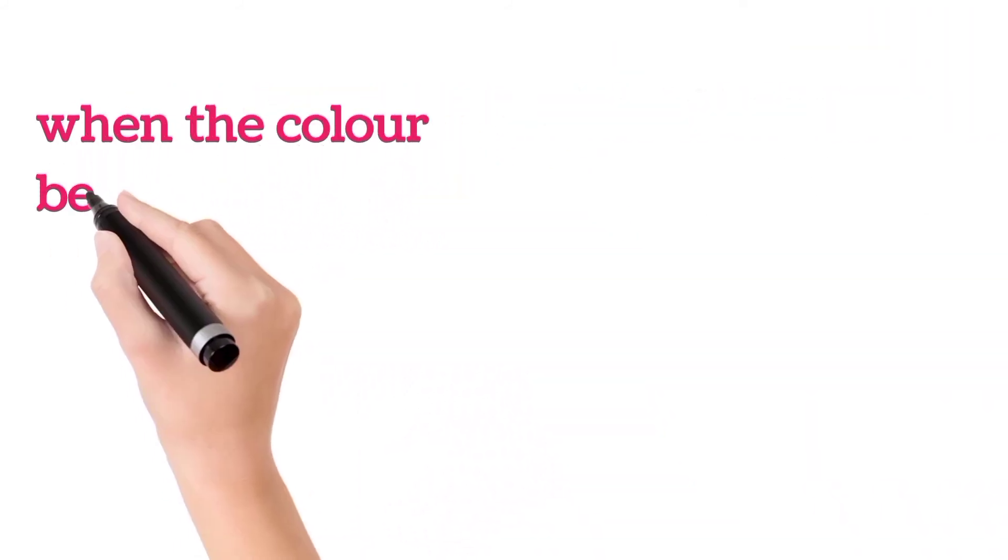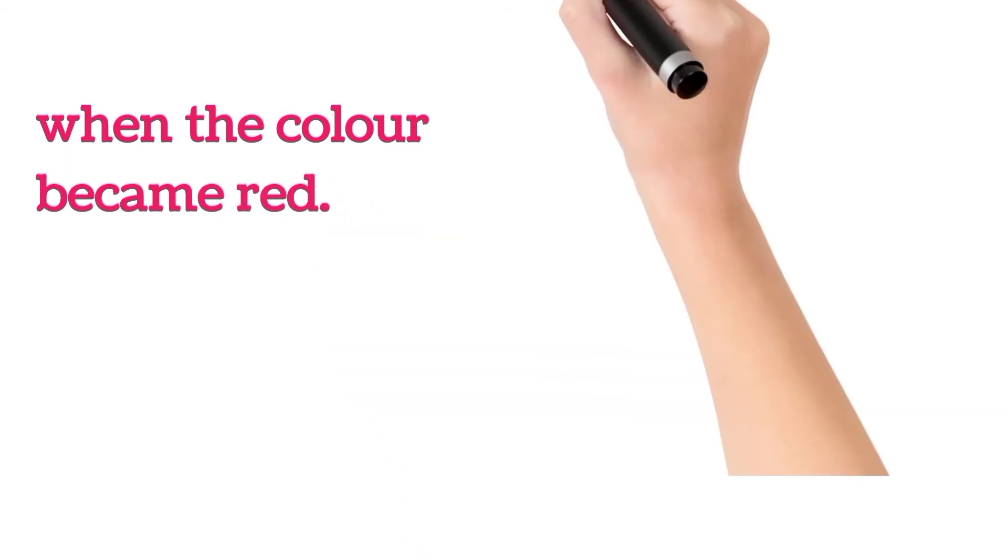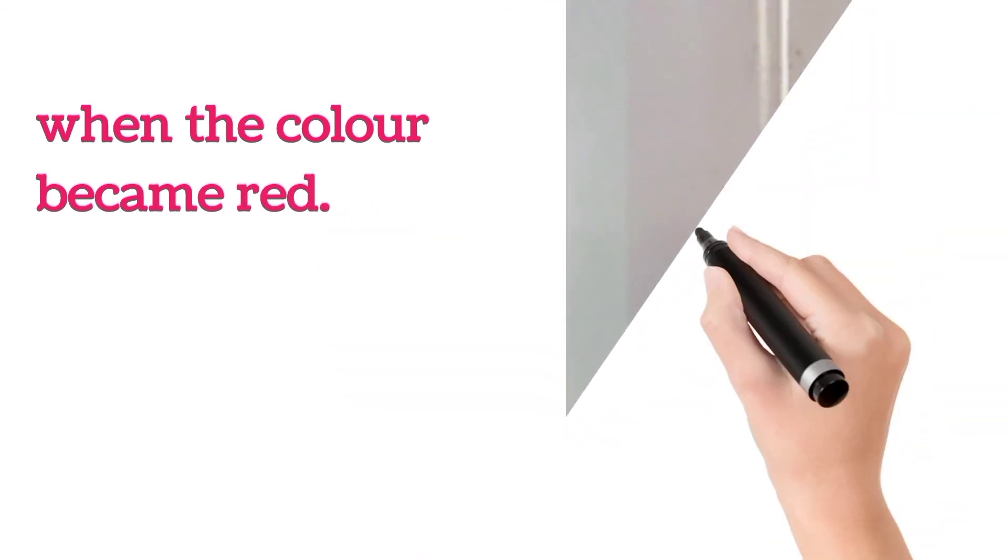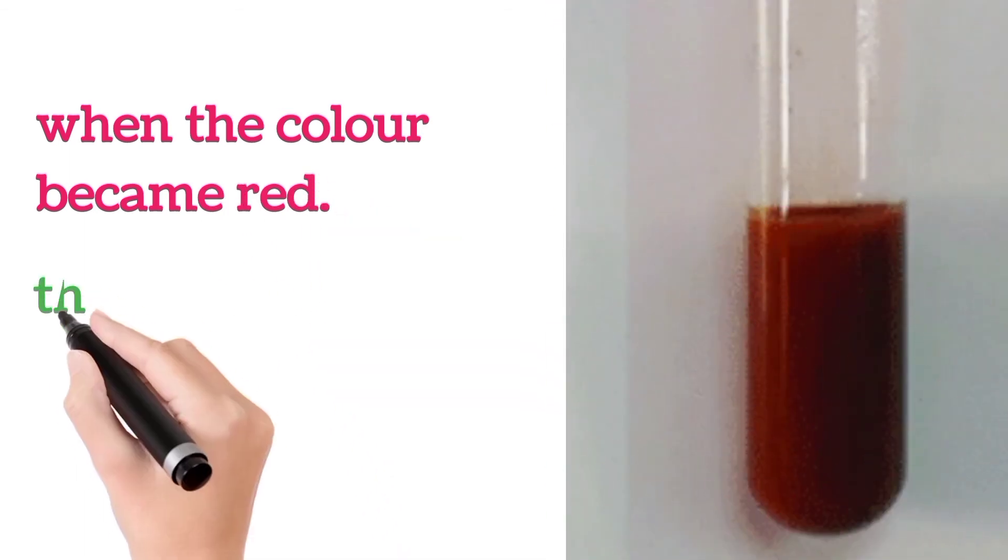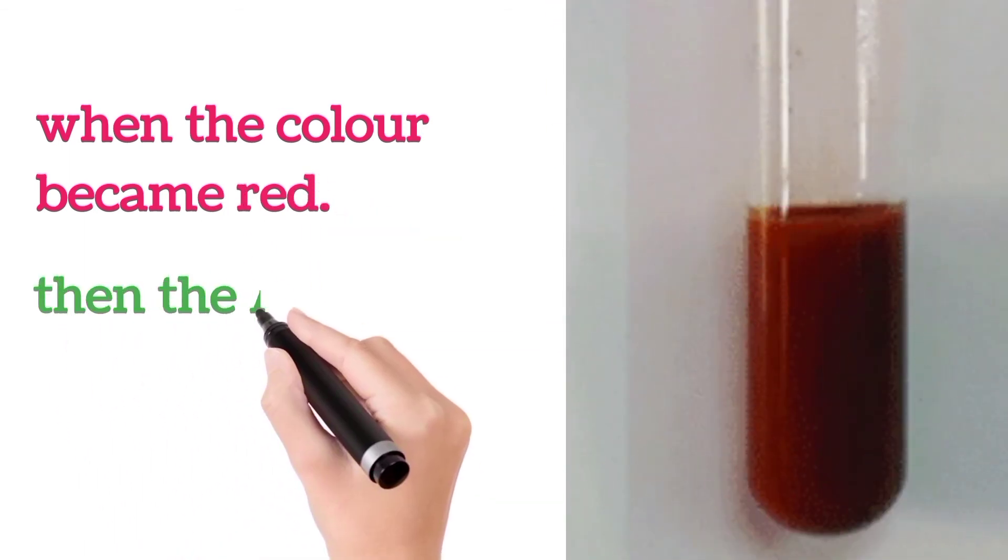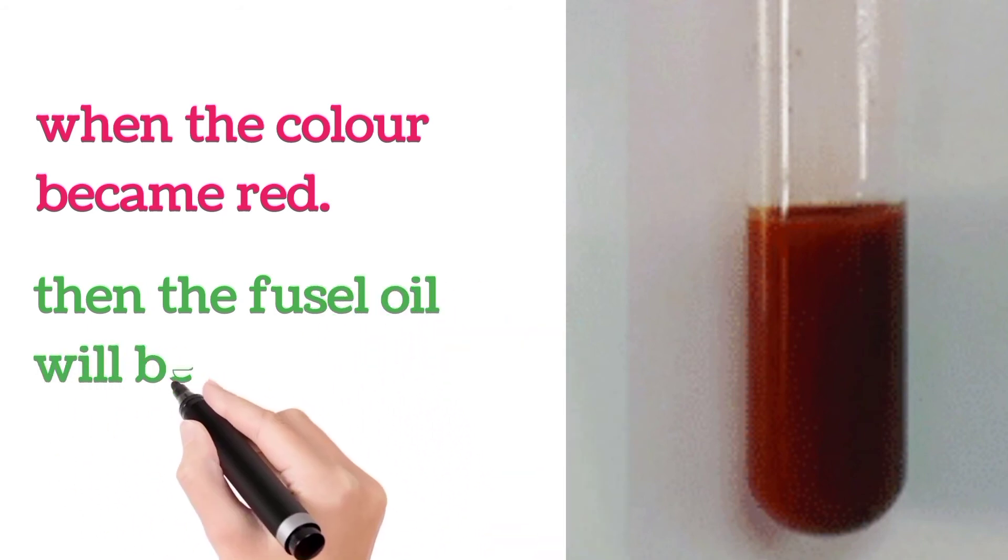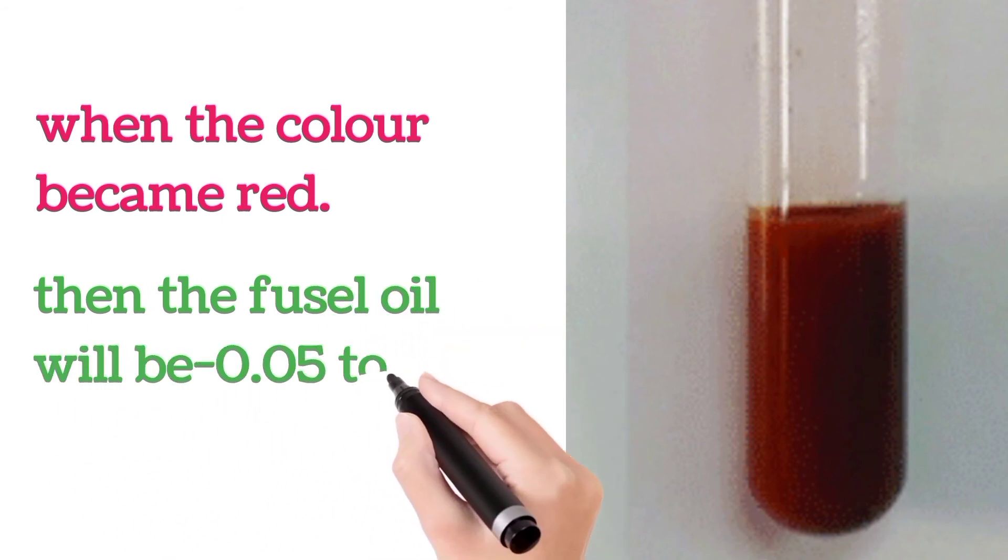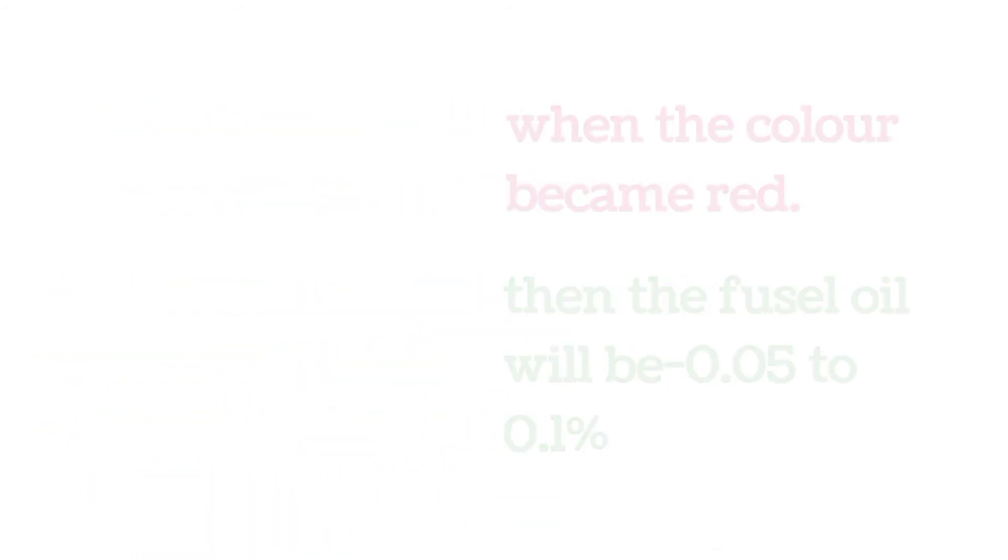When the color became red, then the Fusel Oil will be 0.05 to 0.1%.